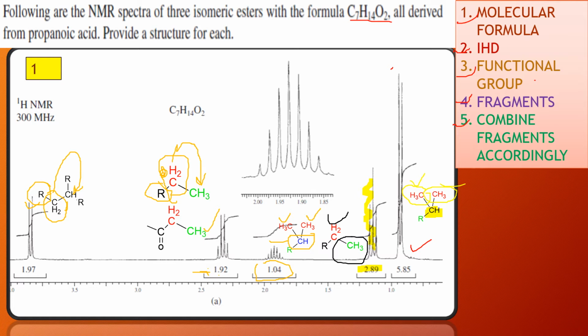Now we have to decide which group is attached to oxygen, and which group would be attached to the carbonyl, right? So we have to decide.